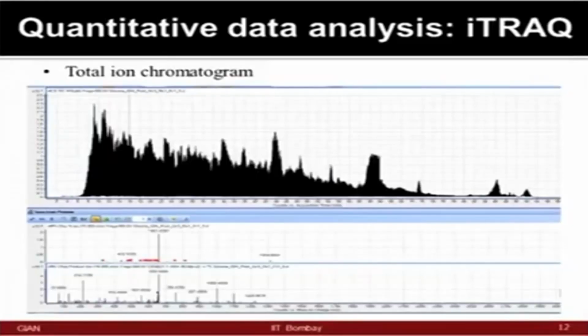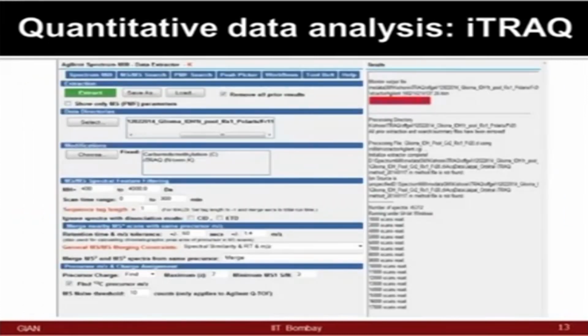So, in that way coverage becomes very important, and to do that people follow this strategy in the iTRAQ based workflow. You can see the MS ion, like if you just pass through, you will see certain MS fragmentation pattern. If you do MS/MS, now you can generate the reporter ions, which could be used for the quantification. While I will not talk in much detail right now about the parameters, there are various platforms available for doing data analysis for iTRAQ.